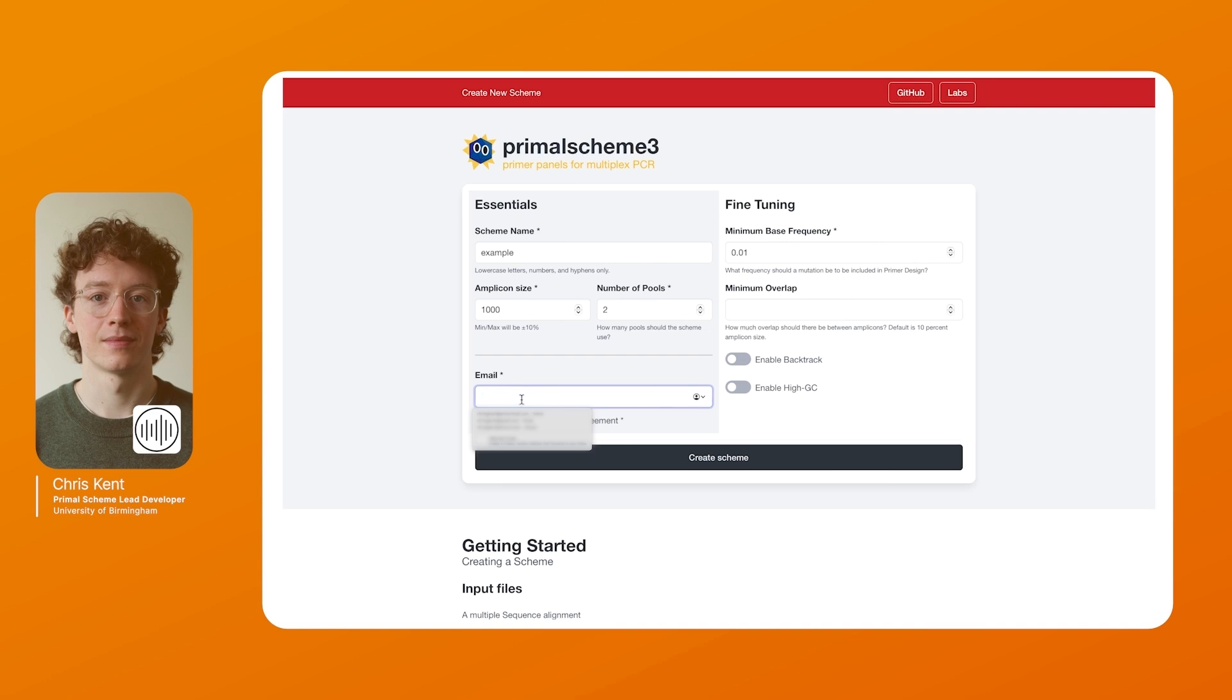You want to include an email listed here. This is just when the job runs we can send you an email to update you when it's all done. For the fine tuning options we have these two options called minimum base frequency. This is the frequency that an allele needs to be at to be included in primer design. Because the input files we're using only have 10 genomes, using this default minimum base frequency is fine as it will include all the variants that we have. Minimum overlap is also a default option. Normally we use 10% of amplicon length as this works very well but if you want to customize it you can.